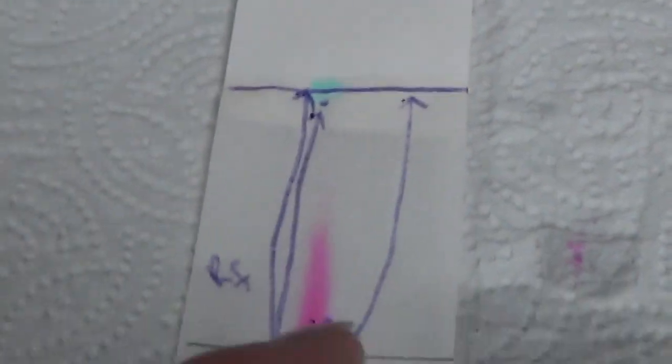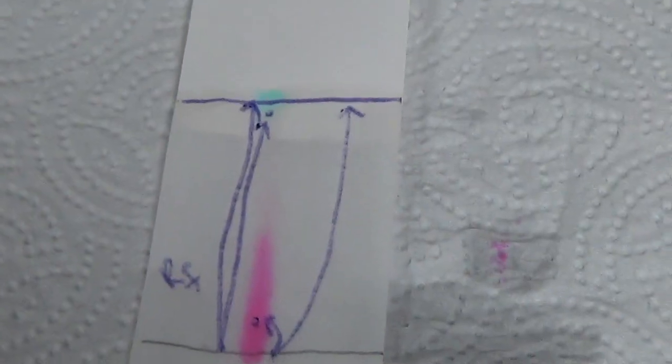So this is the coolness, the power of paper chromatography. It told me this is not a mixture. This is a pure compound. This is one green molecule because I got no other separation. If it was a mixture, then I would easily see a blue dot and a yellow dot, and I would do the same Rf factors I did over here for the purple.